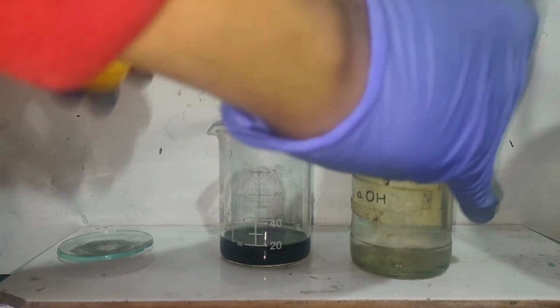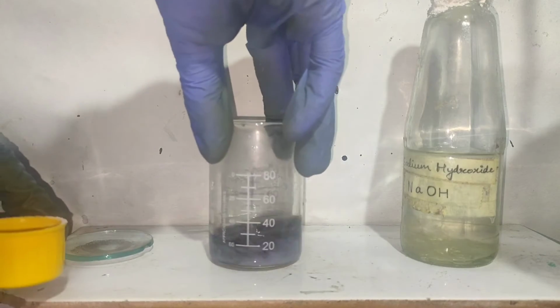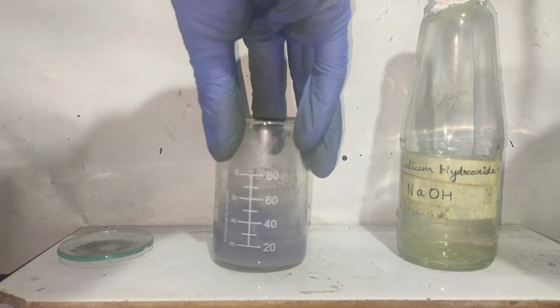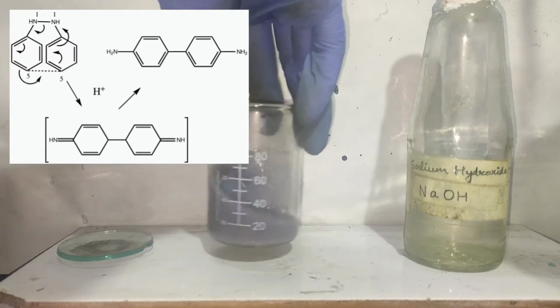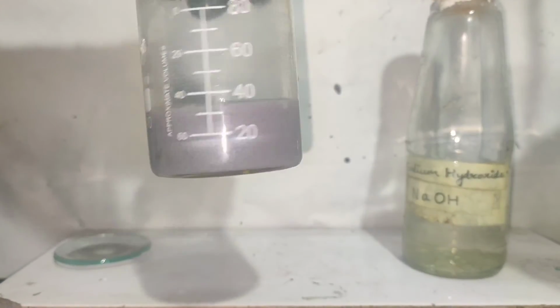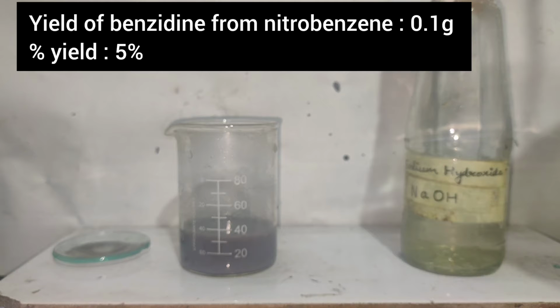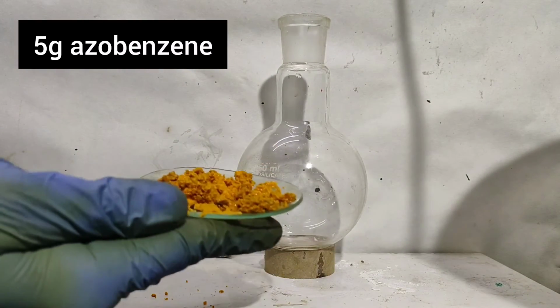The filtrate appears greenish black. To this filtrate, sodium hydroxide solution was added and a grey PPT was formed as reported in literature. This PPT is of benzidine, which is prepared by the benzidine rearrangement from hydrazobenzene, which confirms that Devarda's alloy was successful in reducing nitrobenzene to hydrazobenzene. However, the yield of benzidine was only 0.1 gram, which just stuck to the filter paper and I couldn't recover anything.